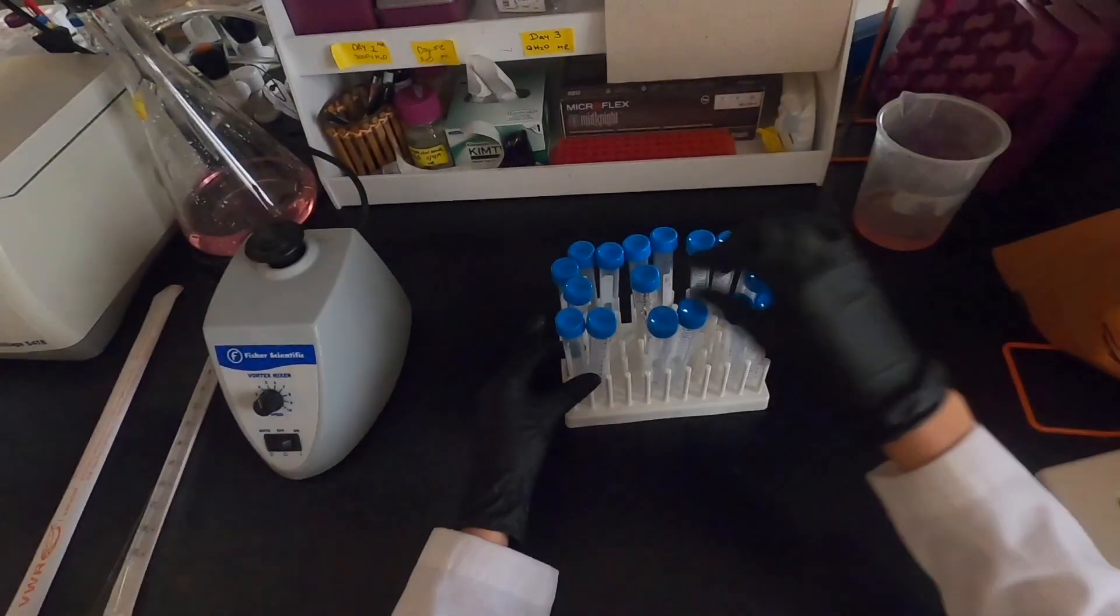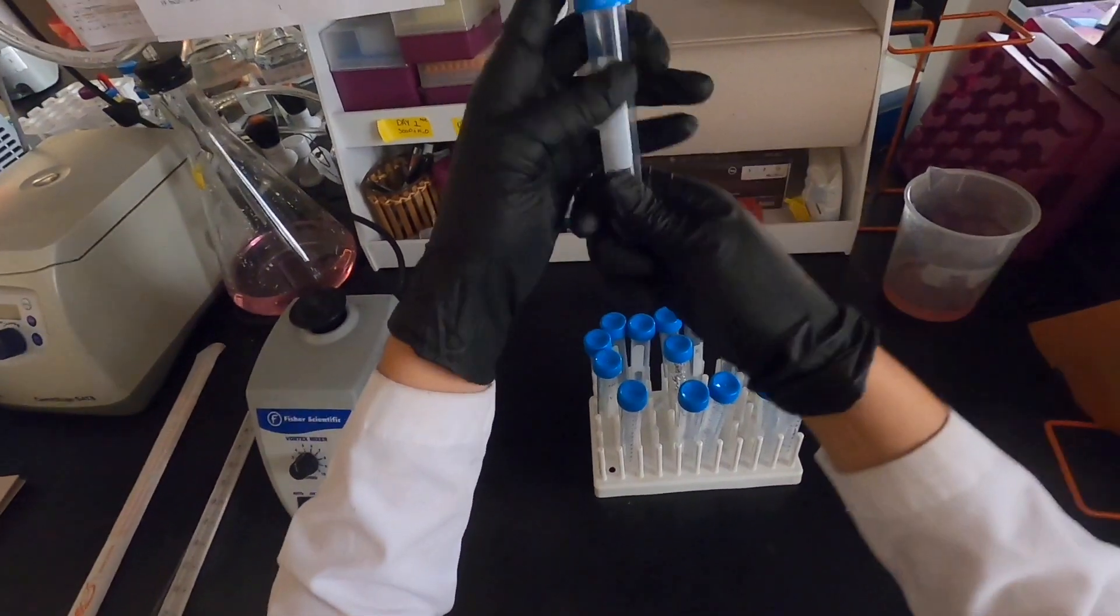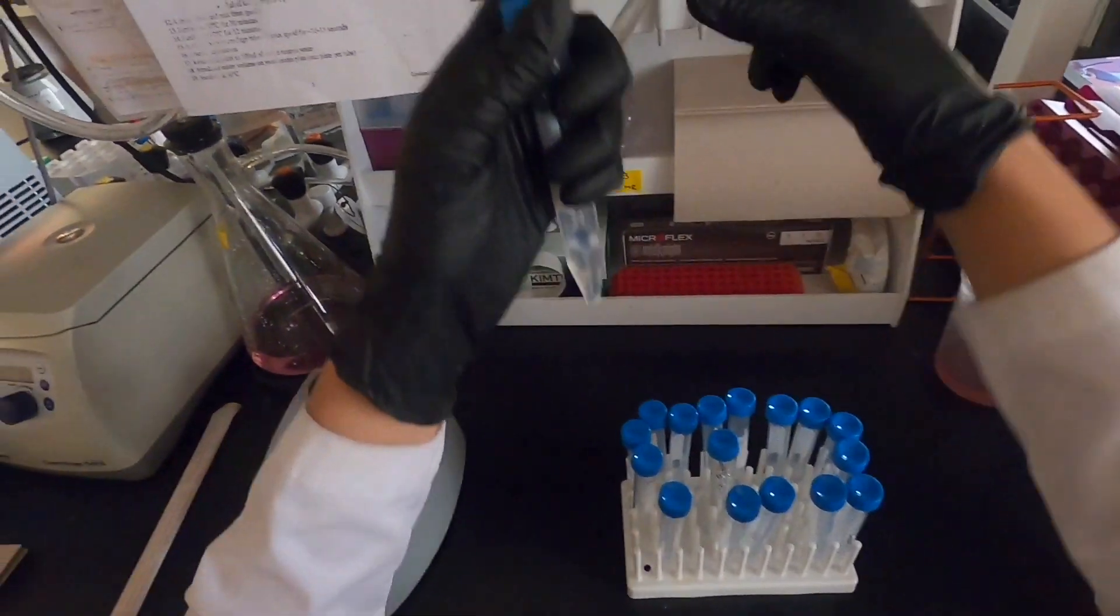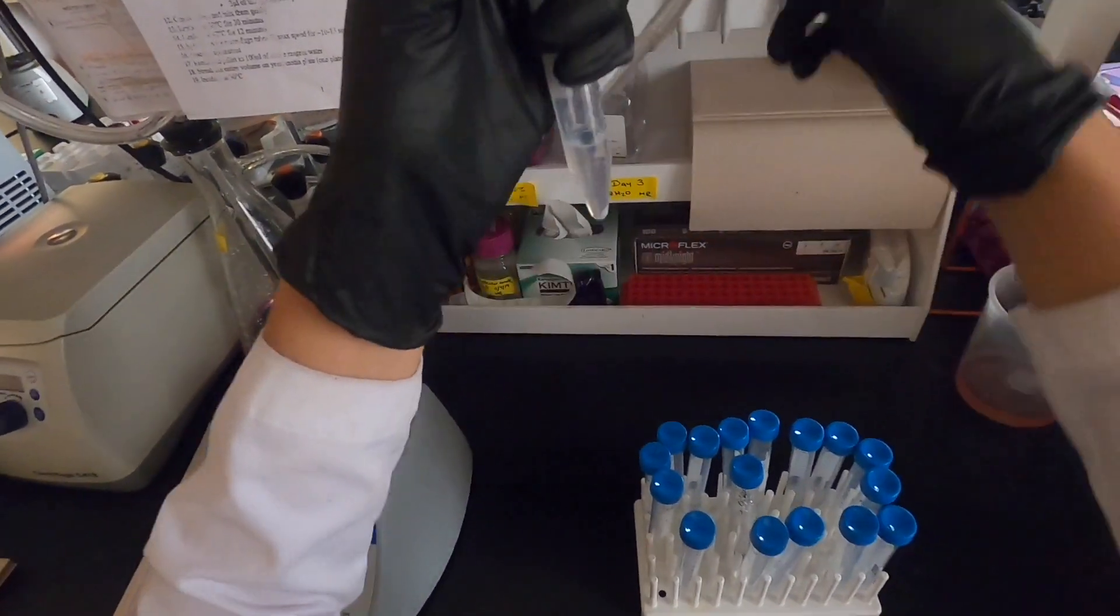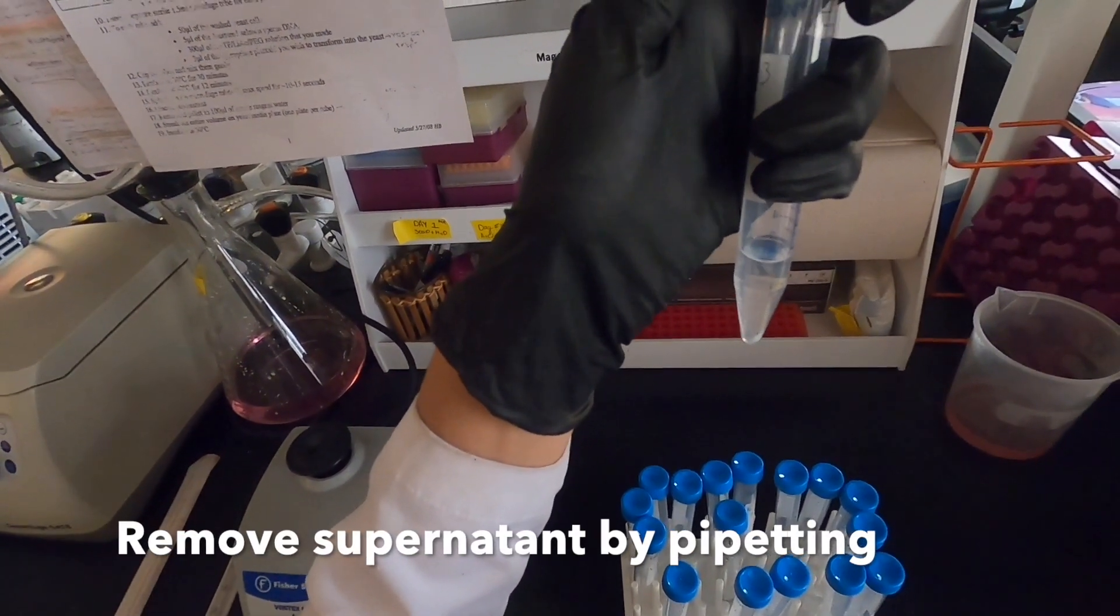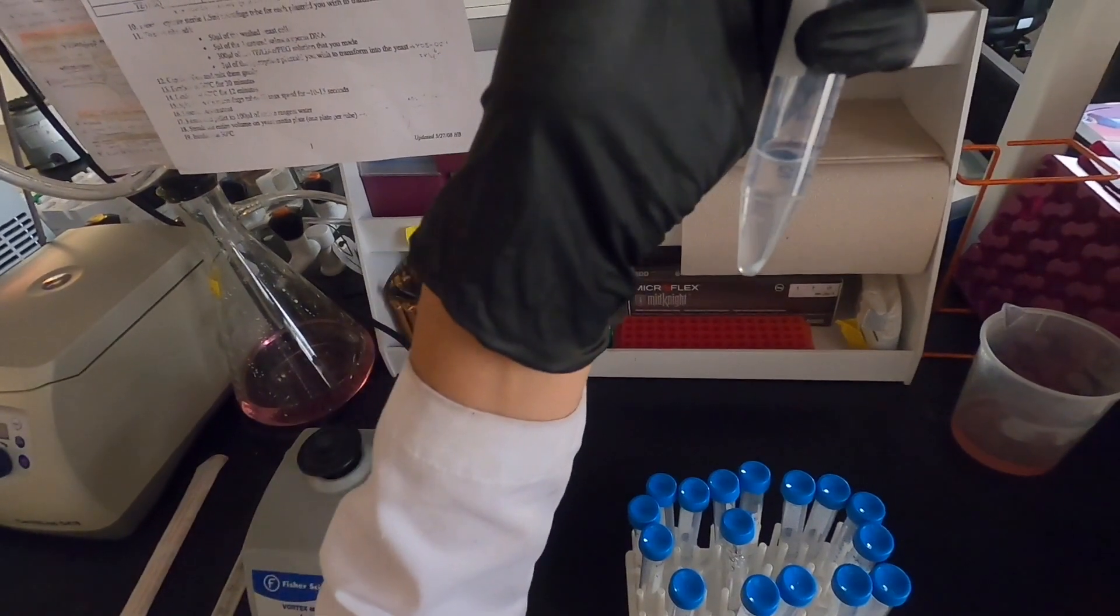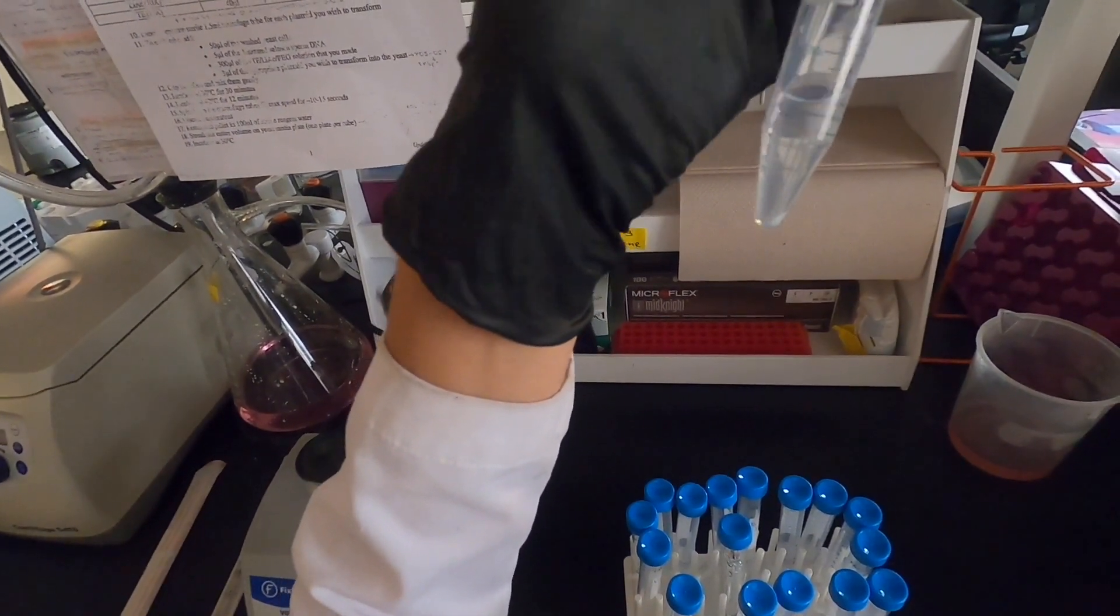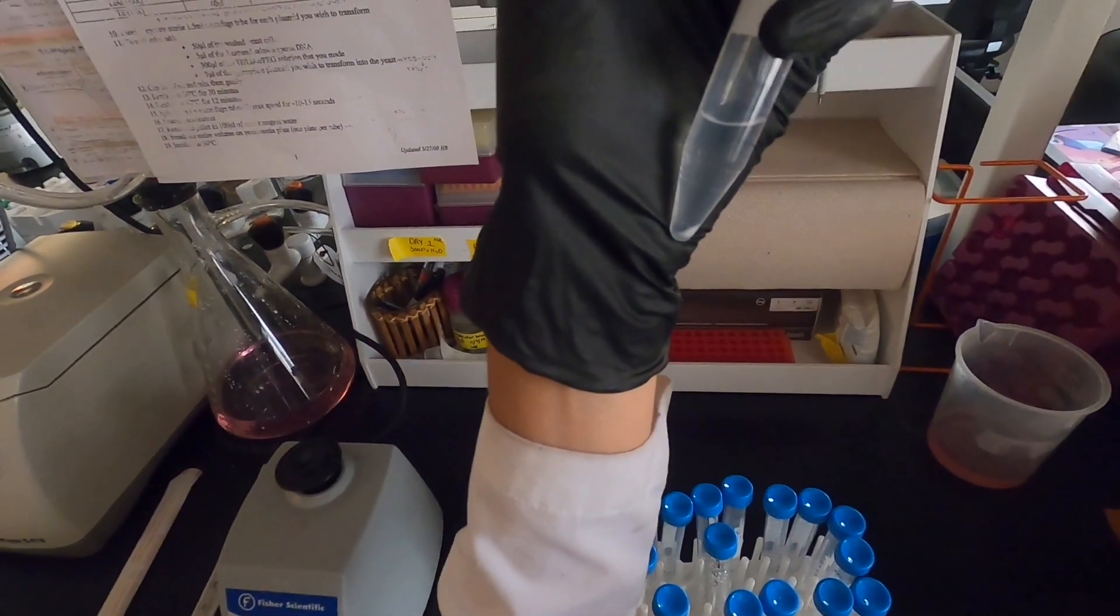This is also followed by a centrifugation step. We are now working under low light conditions since PI is light sensitive. Here we are removing the ethanol solution from the pellet. This time we will not be inverting our tubes. We will gently pipette or aspirate the liquid out of the tube.